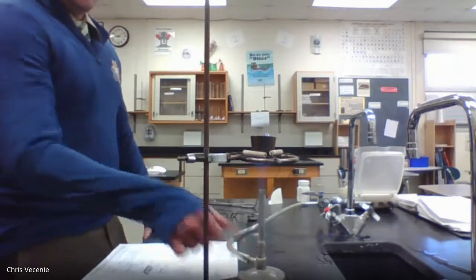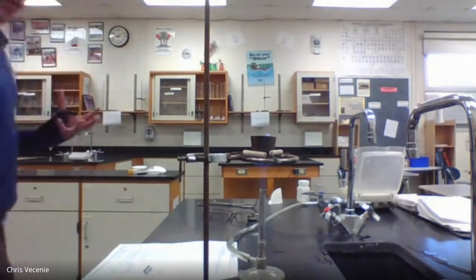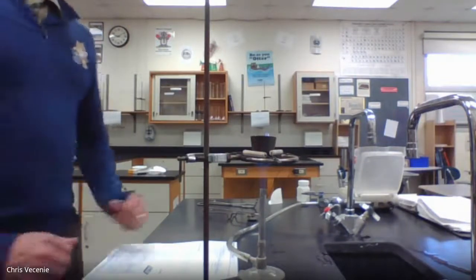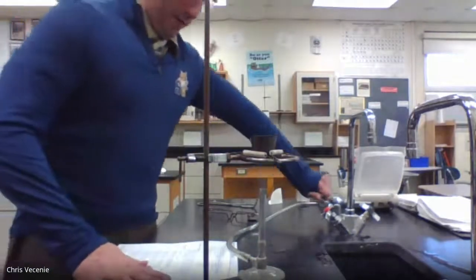All right, so the last 30 seconds, I'll just let it sit and really get that thing going. All right, and then I can turn my burner off for a minute.